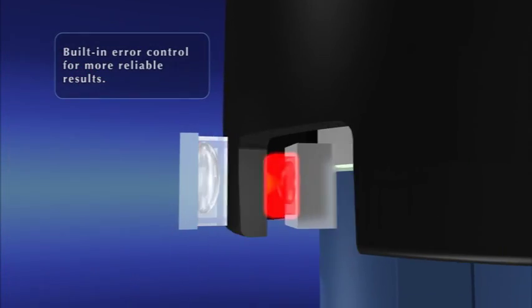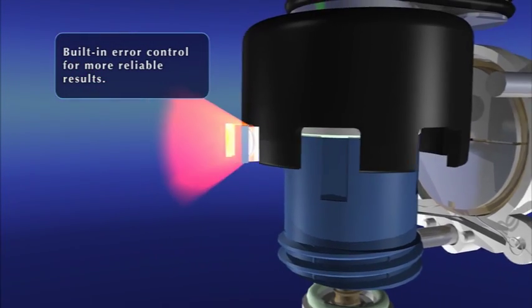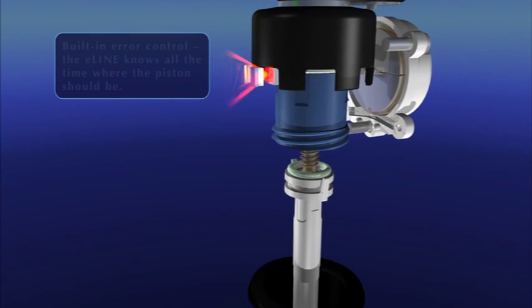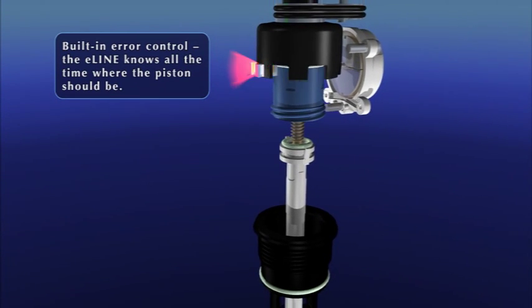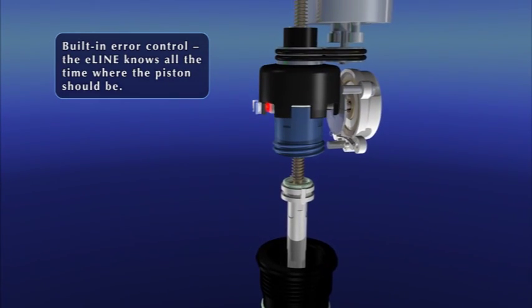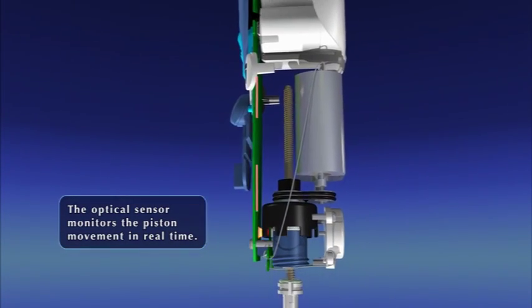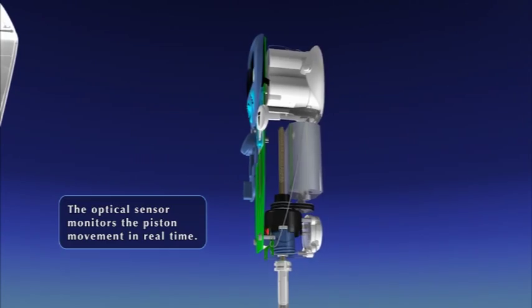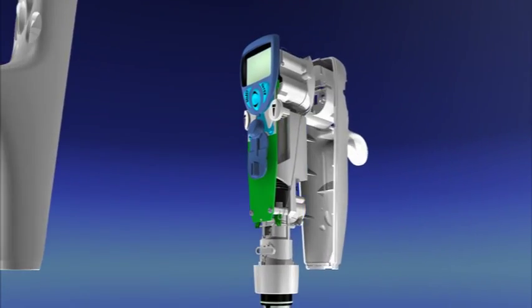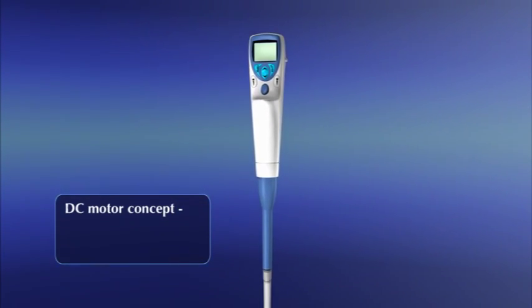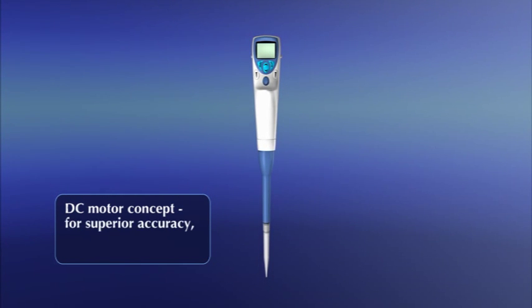Even the best pipetter may occasionally make errors. However, the E-Line features a built-in error control. The optical sensor controls and monitors the piston movement in real time. That means, if an error occurs while pipetting, the pipetter notifies the user about it and results become more reliable. Therefore, the DC motor concept means superior accuracy, precision, safety, and reliability.